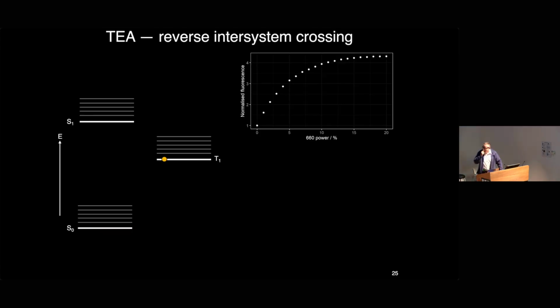The problem is, if you go away and read a few laser physics textbooks and learn how to do some calculations about what the scale of this effect should be, you find that that's way too much. For the laser powers that we're using, you shouldn't get that kind of enhancement in signal. And so this idea that it's stimulated emission that's driving the electron back down to the ground state is probably wrong. So what else could it be?